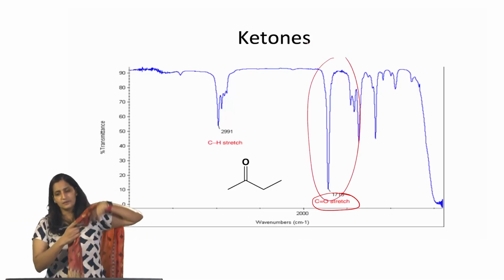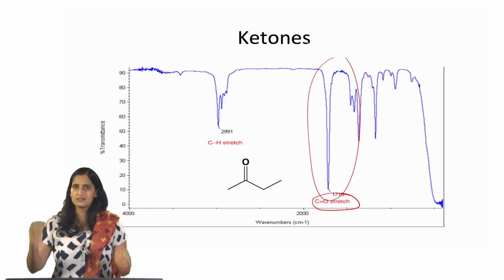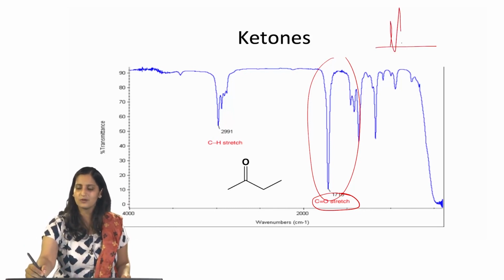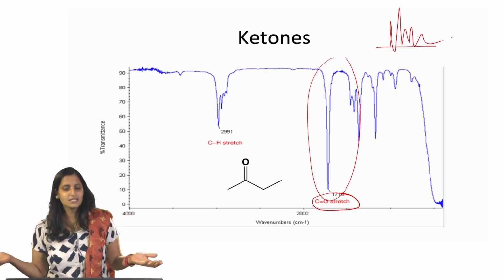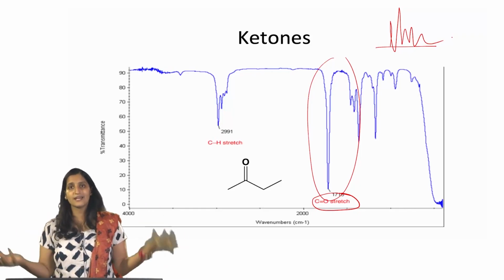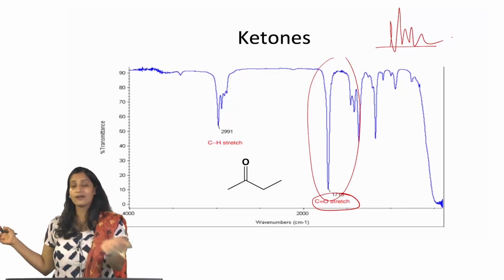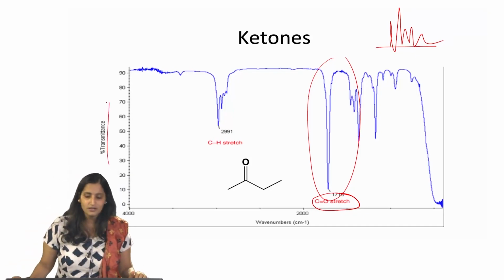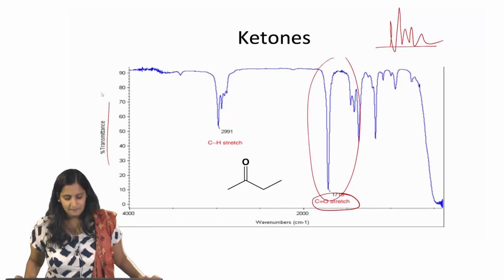Okay. You might be wondering why we are plotting transmittance, where peaks go down, versus typically in most spectra the peaks are going up like this. Well, the story goes that the first time IR was recorded, it was recorded upside down, and so henceforth chemists have just followed this tradition of recording it upside down. So, we record percentage transmittance, not absorption, although IR is an absorption spectroscopy. Okay.